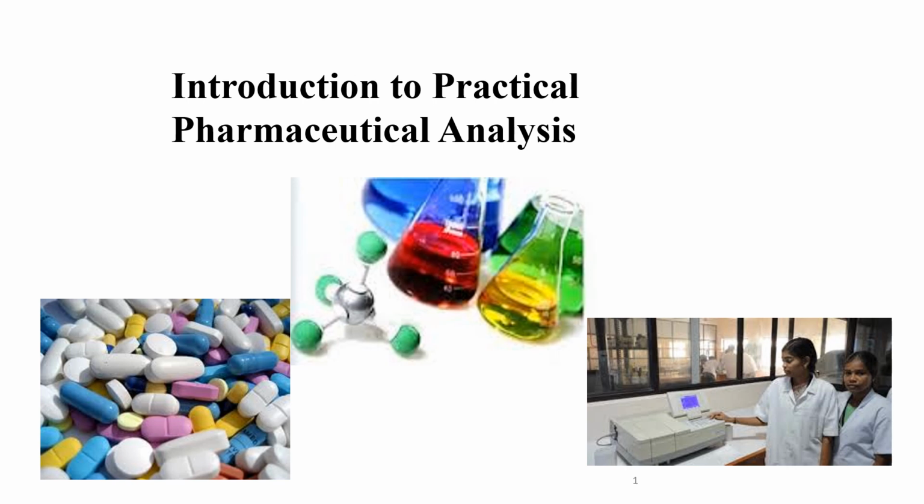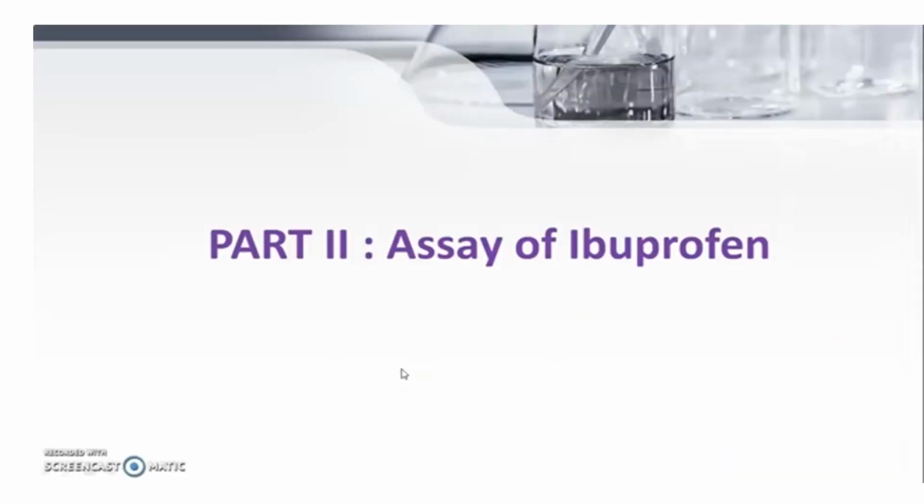Today we try to cover a very interesting drug, which is an assay of ibuprofen. This is the third practical session for our courses for pharmaceutical analysis. I'm sure you will get a very interesting concept from this practical video.